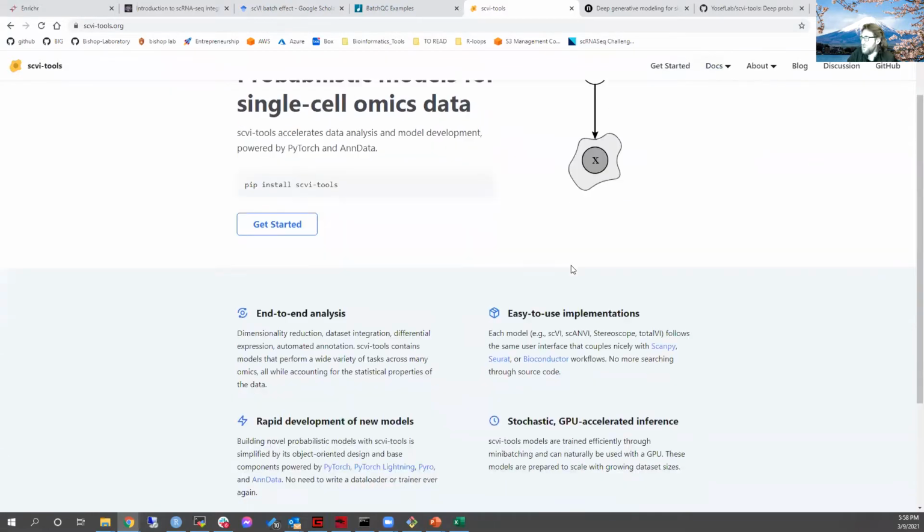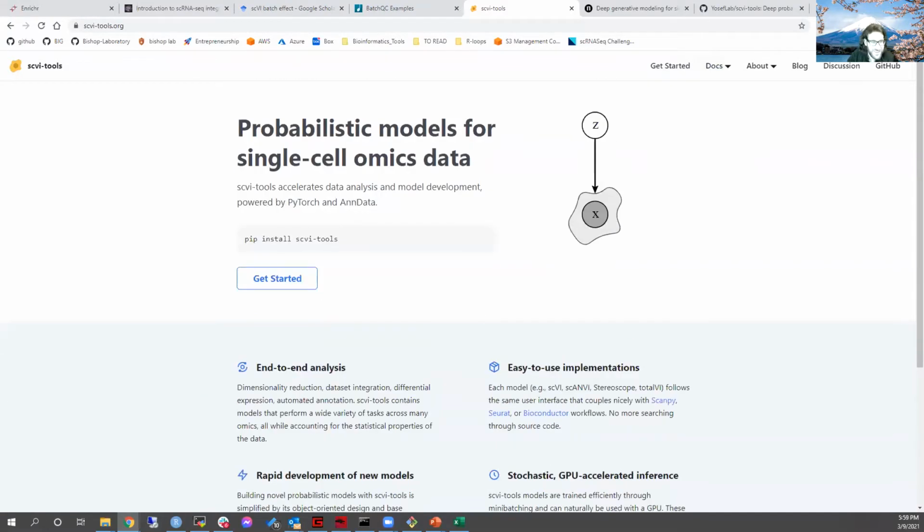But of course, I guess you do have to do this in Python. Okay, so Wes says he always runs batch QC at the beginning of a new study to figure out if you have issues in library prep, cell death, or what the problems in the wet lab are. Yeah, that's a good point.